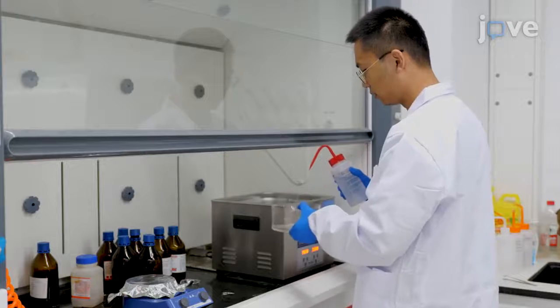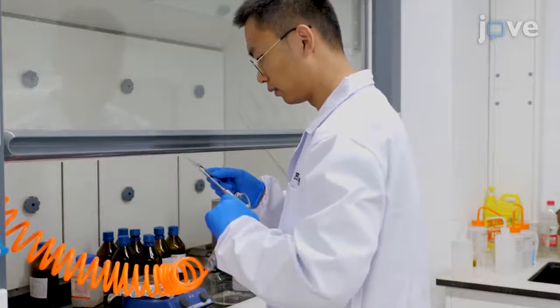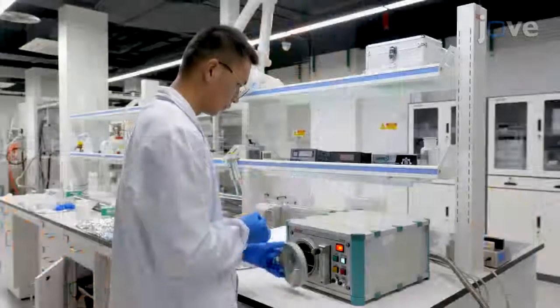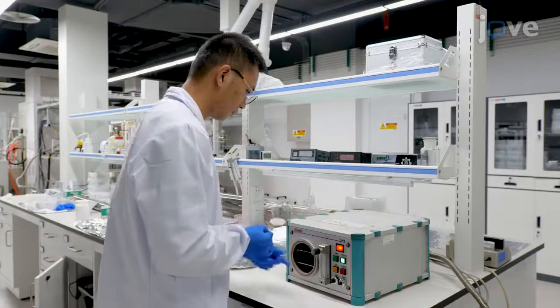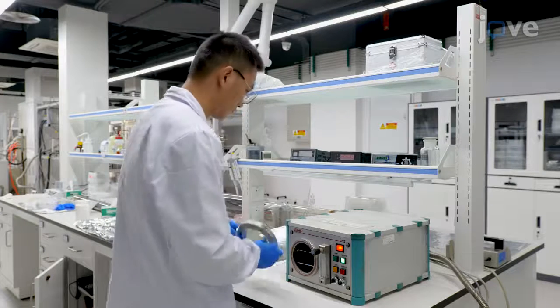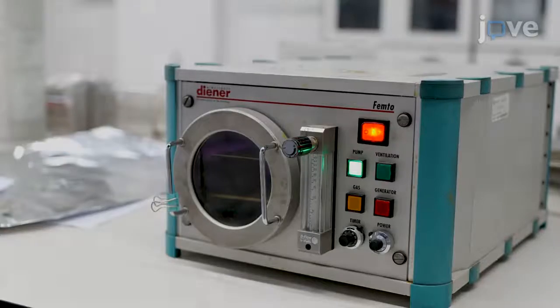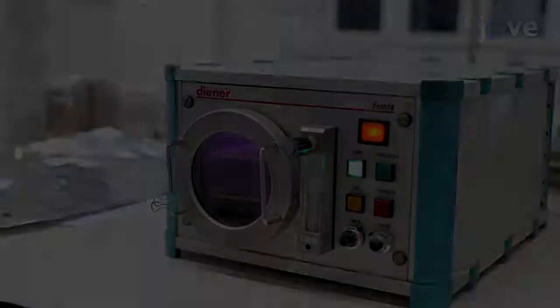Rinse the cooled substrate with deionized water and dry the NPSS with a nitrogen gun. Then, etch the graphene NPSS by nitrogen plasma with a nitrogen flow rate of 300 standard cubic centimeters per minute for 30 seconds and a power of 50 watts in a reactive ion etching chamber.